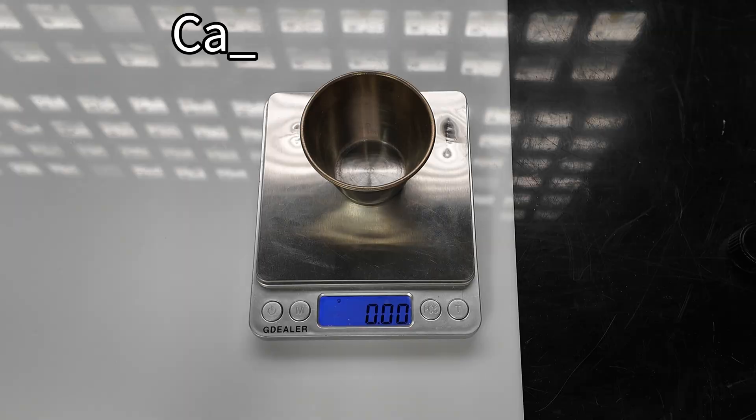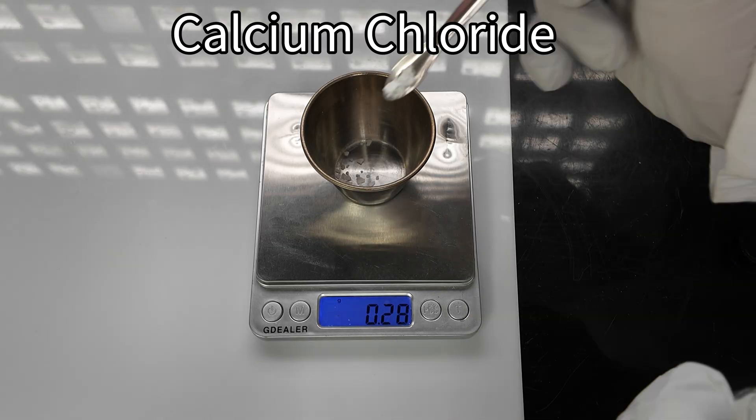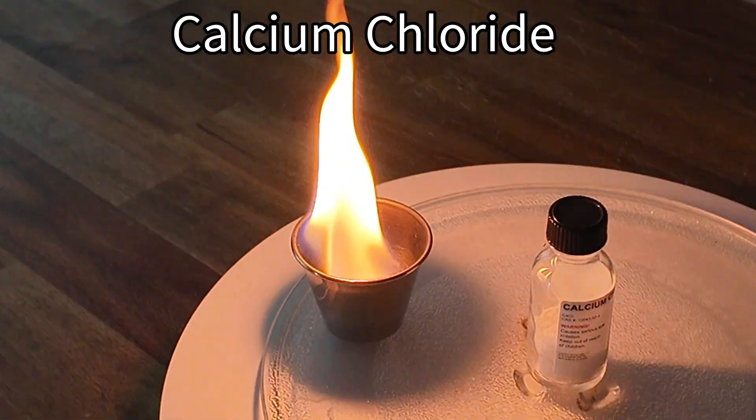So let's start with calcium chloride. As you can see, it is a very intense orange-red hue.